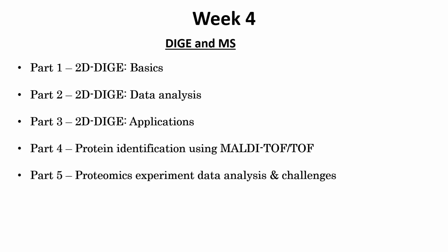Till DIGE, you can still do a certain amount of proteomics analysis, but to make it more accurate, you can use mass spec. In mass spec, one of the techniques is MALDI-TOF. TOF is basically the mass analyzer, and MALDI is the ionization source. That will ionize your protein of interest. TOF is the analyzer, so it will analyze the protein depending upon the mass to charge ratio. That's what Sir talked about in lecture 4, protein identification using MALDI-TOF.